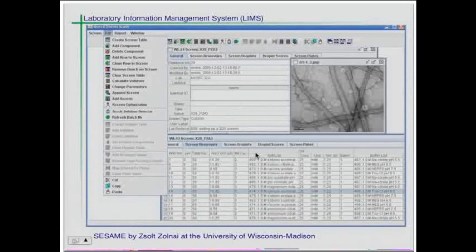And then these images of each of those conditions, in this case this particular condition, is very different from the screen that I showed you at the beginning. This is part of an incomplete factorial screen that we used, developed by Michael Landsberg here, and by Ben Hammer in Australia.